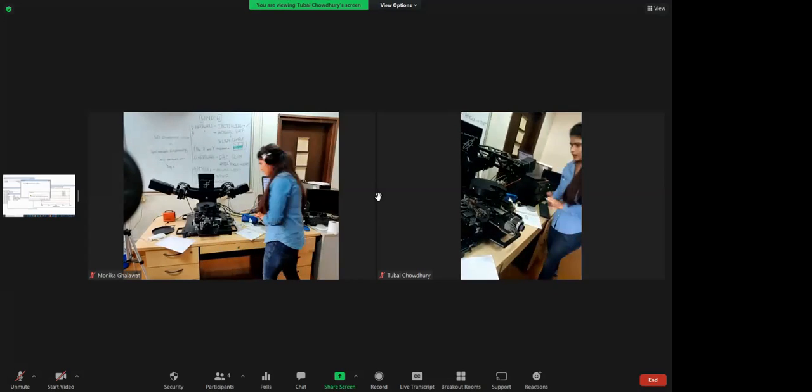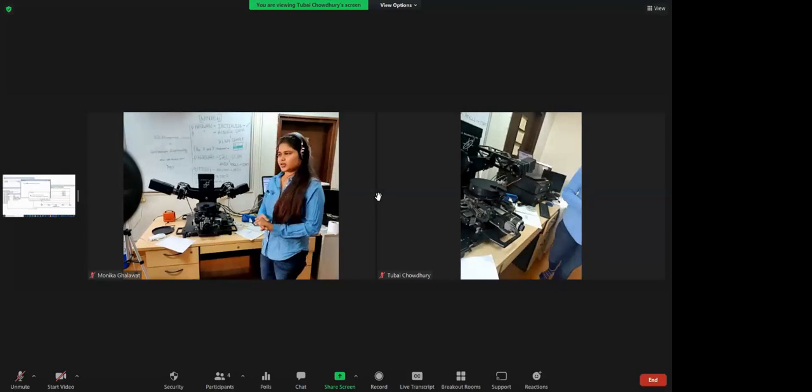Ma'am, as you were performing for the glass slab, you used the Cauchy model. And you also said that there is one other model for a smoother surface. I don't remember the name. BK. BK. Okay. Let me ask my question first. Let me complete my question.